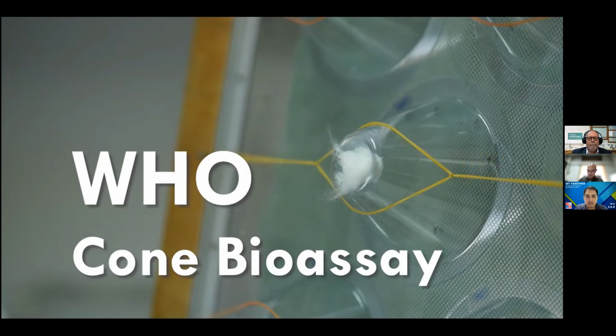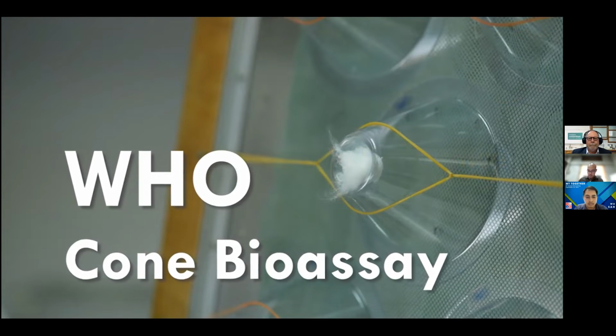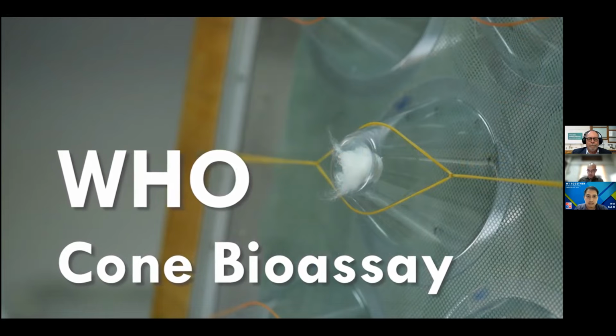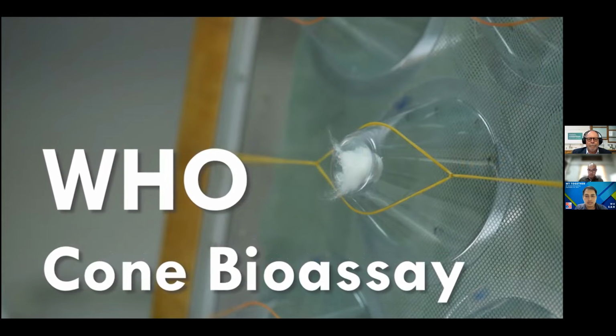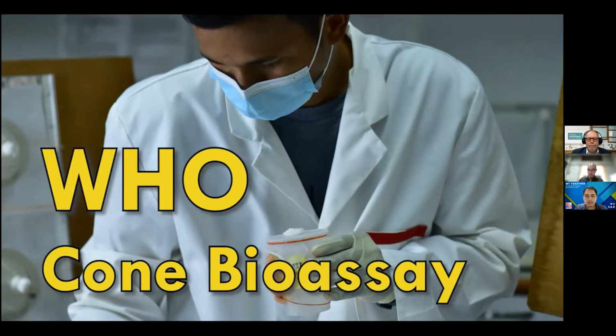Hello everyone. In this tutorial, we are going to discuss and demonstrate the WHO cone bioassay. This is not a test for insecticide resistance in mosquitoes, but instead a test for residual efficacy of insecticides in insecticide-treated surfaces. Is the insecticide still working, or has it decayed significantly? So really, we are not evaluating the mosquitoes so much as evaluating the treated surface.